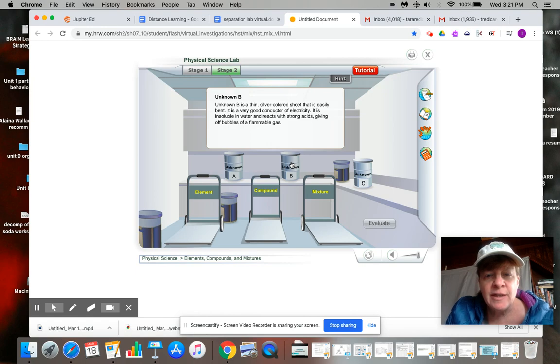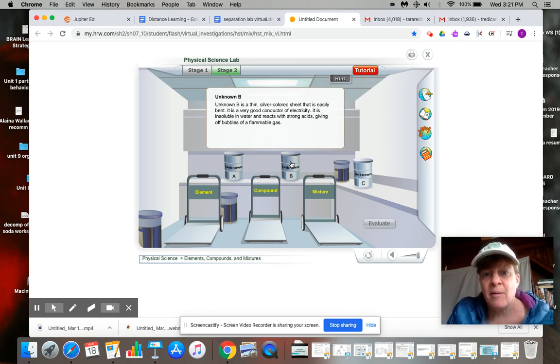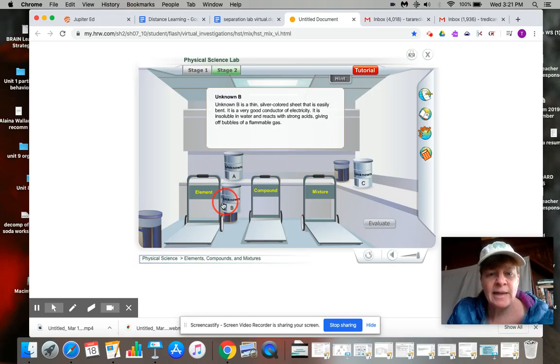Unknown B is a thin silver colored sheet, easily bent, good conductor. That's sounding like a metal. Okay, so let's put that as metals or elements.